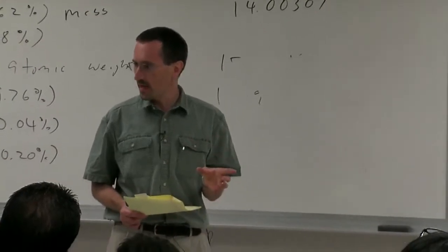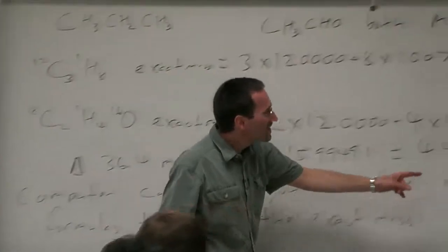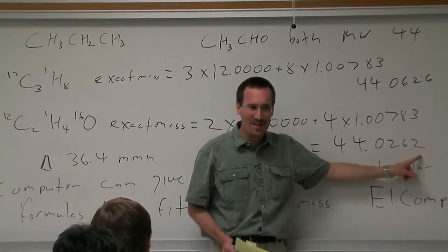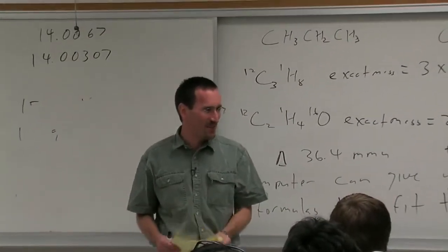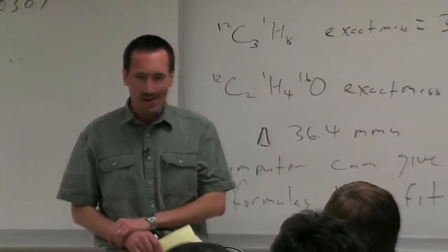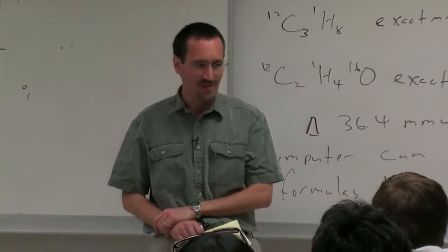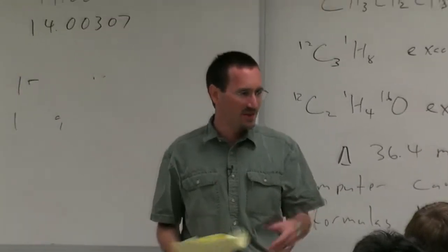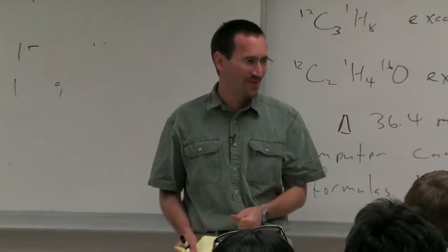So I was reviewing a paper, and all of the exact masses fit to the last decimal point within a few tenths of a millimass unit. And my first thought was, this guy must be cheating here. Somebody must be doing fraudulent research. I called up John Greaves and I said, what could be giving such precision? He said, do they have an ion cyclotron resonance mass spec? And I said, well, they didn't list it in their materials and methods section. But I went to their website and it's like, bam, sure enough, they do.